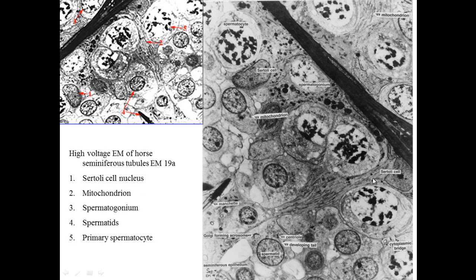And you can see that the Sertoli cell is kind of like a tree. Sertoli described it first with branches. They're not really branches, they're more like bed sheets that surround the germ cells. So the germ cells are not inside the cell itself. They're in a little pocket of the cell.